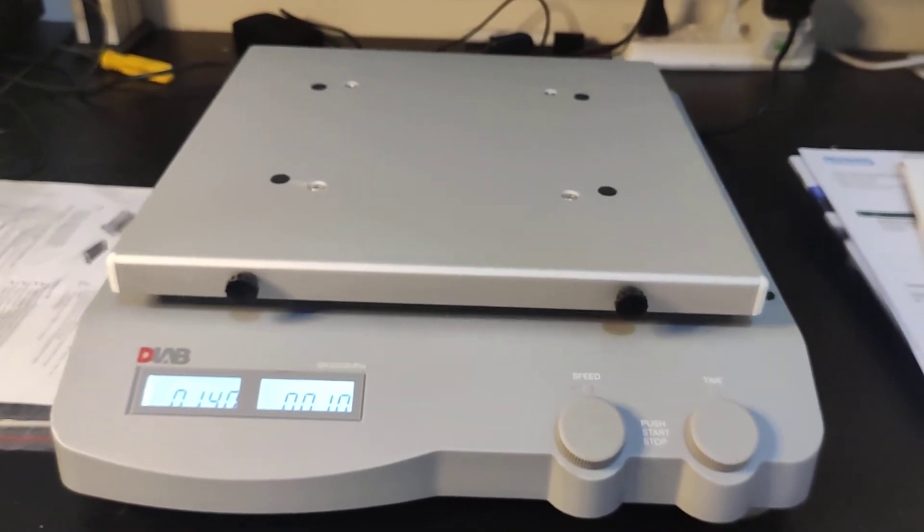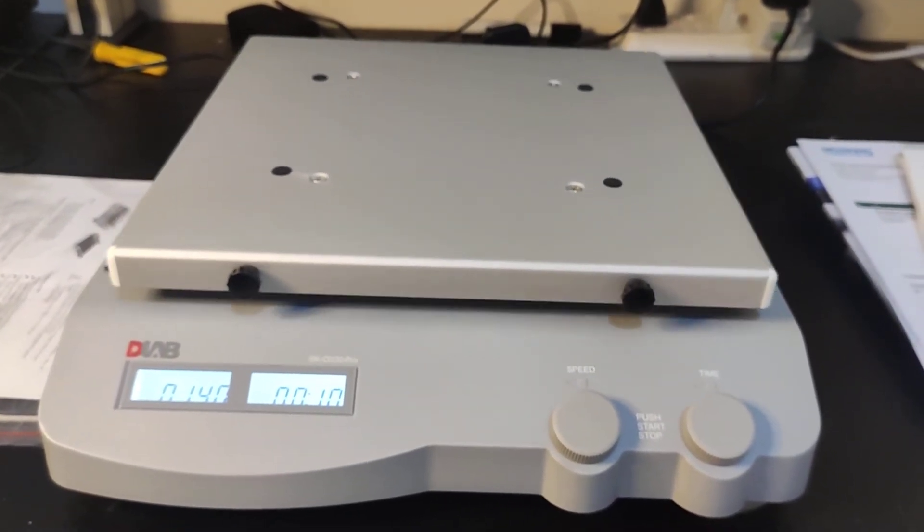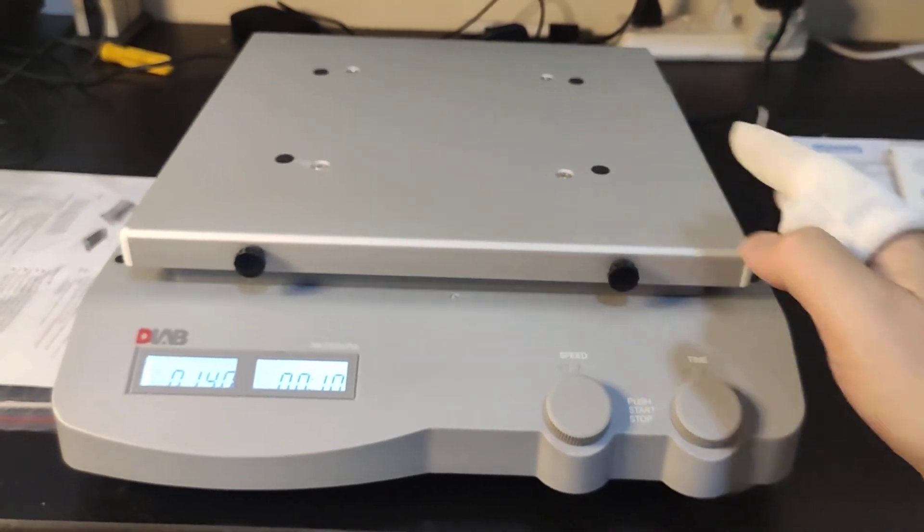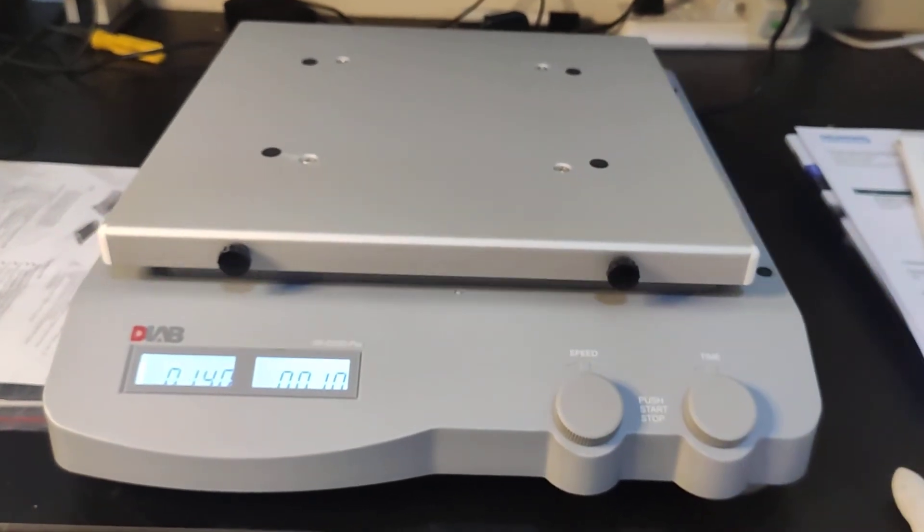But this one not yet attached with the top plate. There's many kinds of top plate can be attached. This is the basic unit.